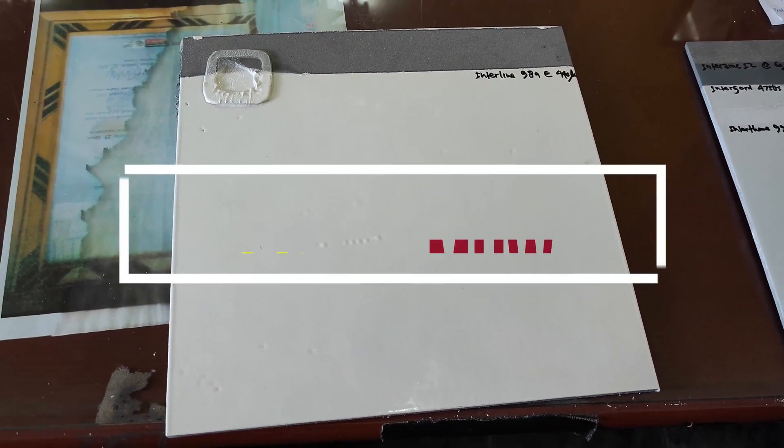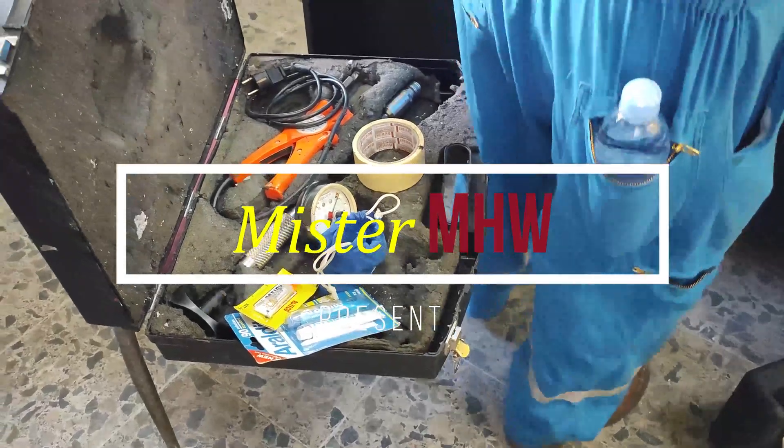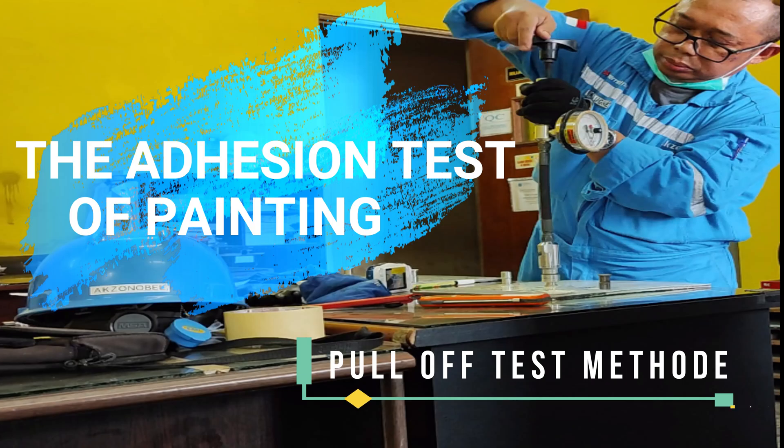Hello everyone. Welcome to this channel. This video will show you how to demonstrate the adhesion test of painting using the pull-off method.